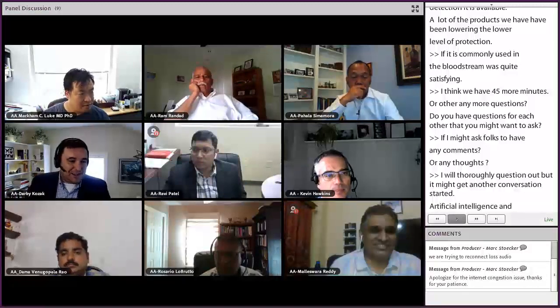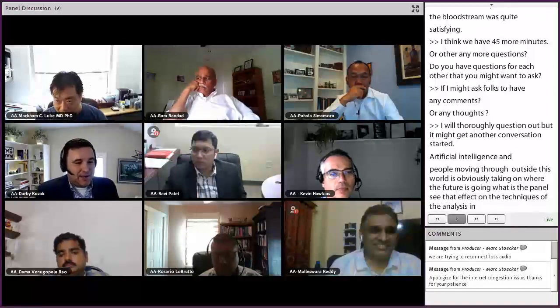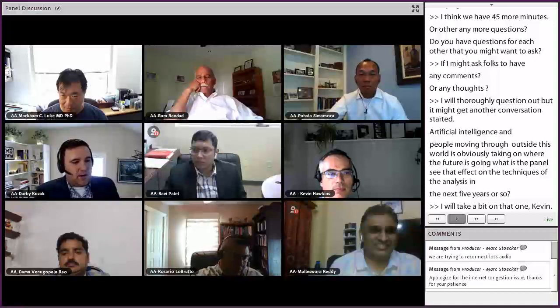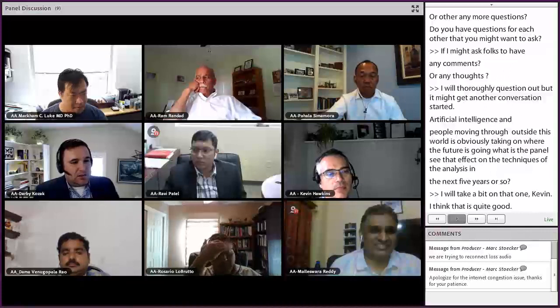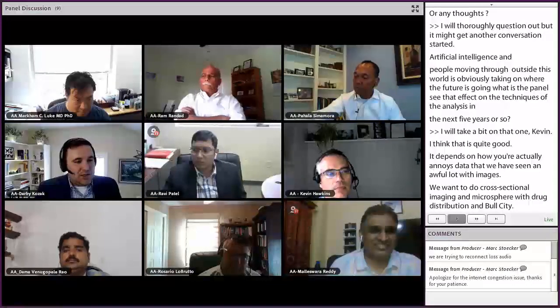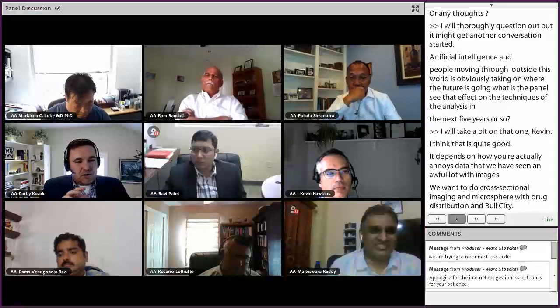I'll take a bit on that one, Kevin. I think it's quite good. A lot of it's going to become how you're going to actually analyze complex data. We've seen an awful lot with images, where you're able to do cross-sectional imaging. I showed in one graph PLGA microspheres with drug distribution and porosity. Now it's a lot of image analysis and resolution. AI can be taught to do some of that image recognition, similar to facial recognition already being used, to identify specific regions of drug versus porosity, and then do an equation of that to do a comparison.